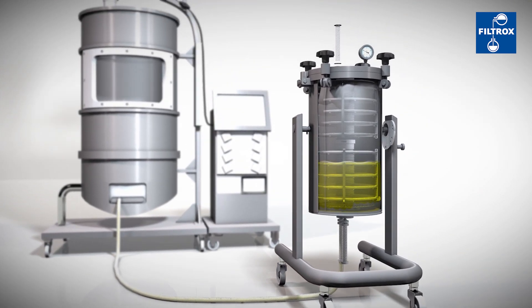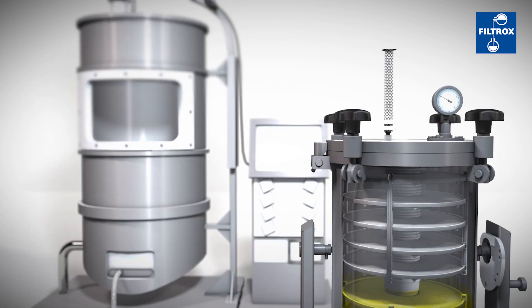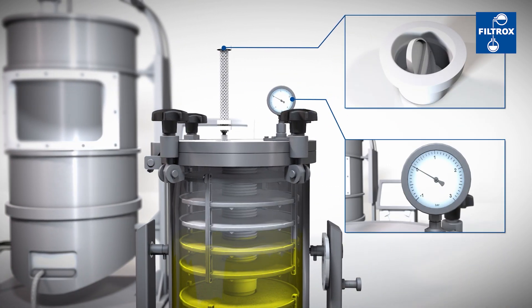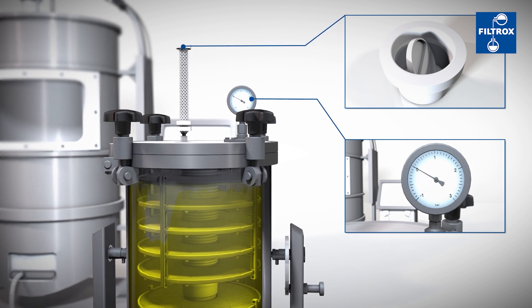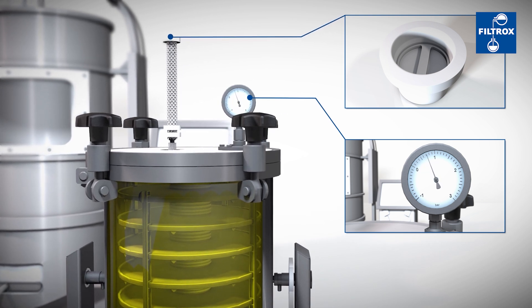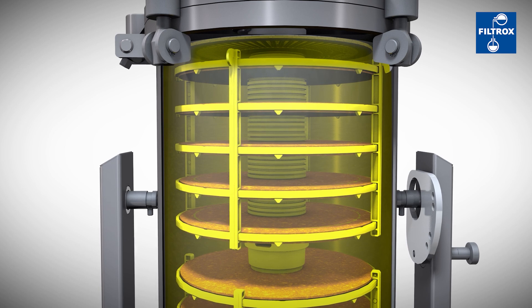By filling the filter with the broth, the bag expands so that it takes up all the space of the Diskstar SU support housing. During this process, the air vent is open and the pressure is currently at 0 bar. Once the PuriDisc SU filter is completely filled, the air vent gets closed. The pressure is steadily rising until it reaches 2.5 bar.